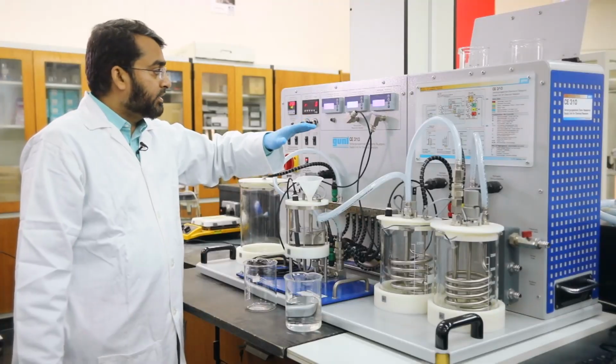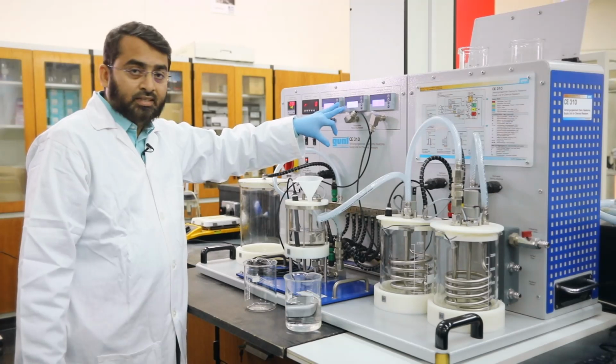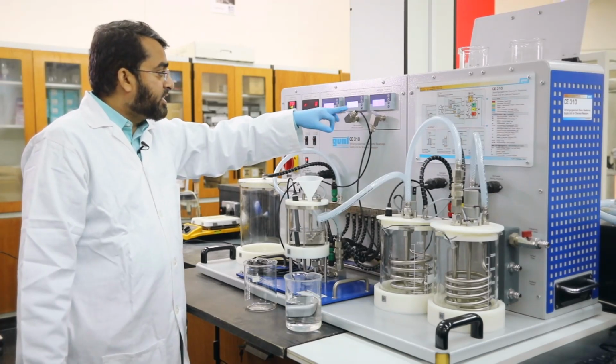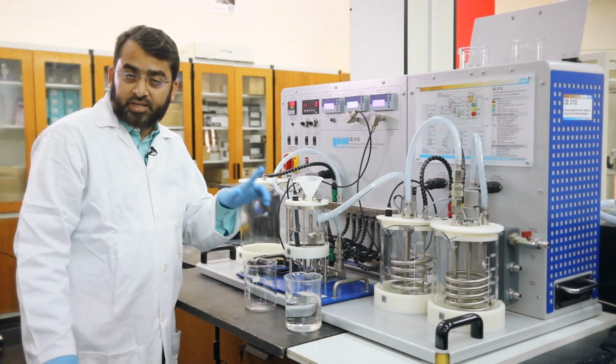We are conducting this experiment at room temperature, so you can see the temperature is around 21. So this is stable now. This is the conductivity of 0.05 molar NaOH.